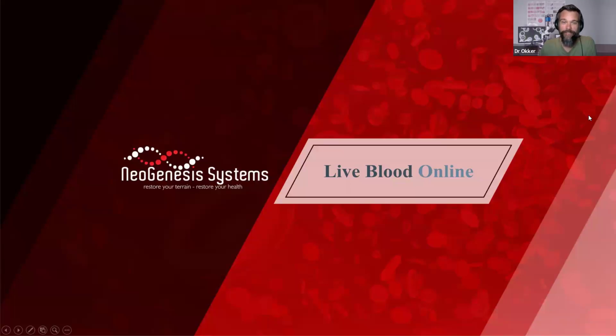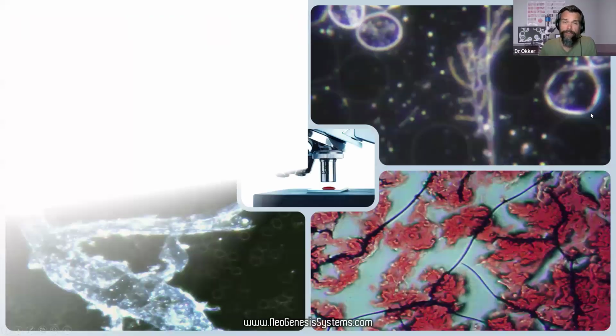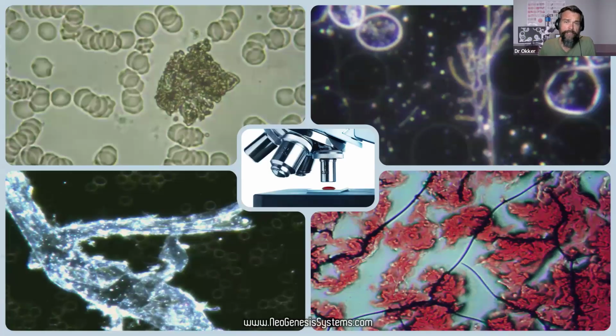So let's get started right away. We have a few examples here of the type of images that we see in live and dry blood samples. We'll see that there are two images there against a dark background. So those are examples of live blood viewed in dark field. The image on the top left-hand side there is an image of live blood viewed in bright field. And it is important for us to actually view samples in bright field and dark field because there's a variety of anomalies that really only show up clearly in dark field.